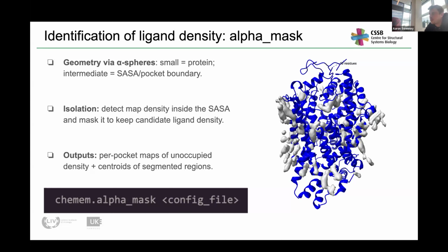Another thing we did was more of the map. We had a ligand that had multiple conformations, but in this approach, we went back to the map and tried to tease out both of the conformations and then fit. Yeah, that's the serotonin receptor, right? Yeah, there's a preprint out there which explores that. But yeah, it's possible, and you may or may not get both conformations within the solutions given back. However, I only did it for one case, so I'm not sure if it's applicable to all cases.